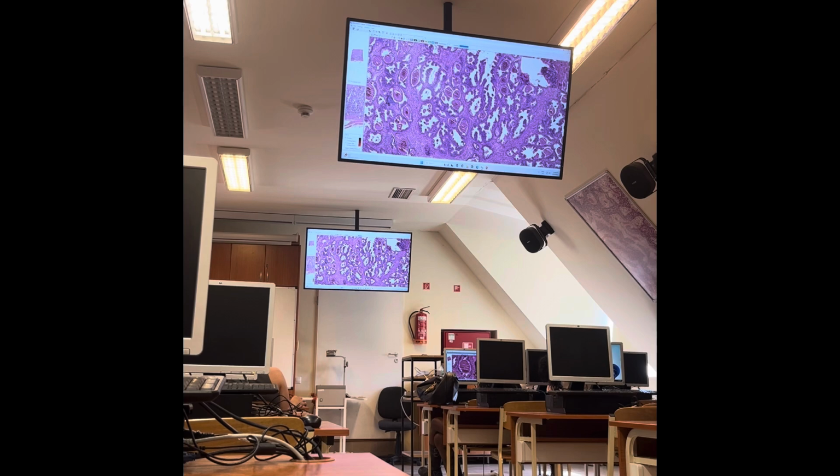In the early childhood, these are not present in the prostate gland. They appear during the aging process, and their number is increasing. We can identify these structures in all gland types of the prostate gland. When they accumulate in high number, especially in the mucosal glands of the prostate, they may cause enlargement of the prostate.